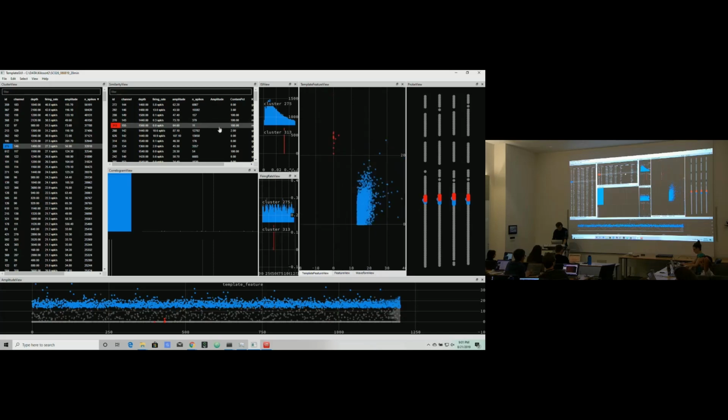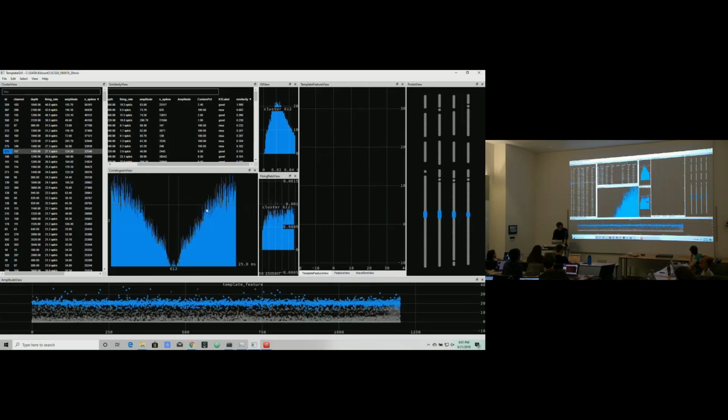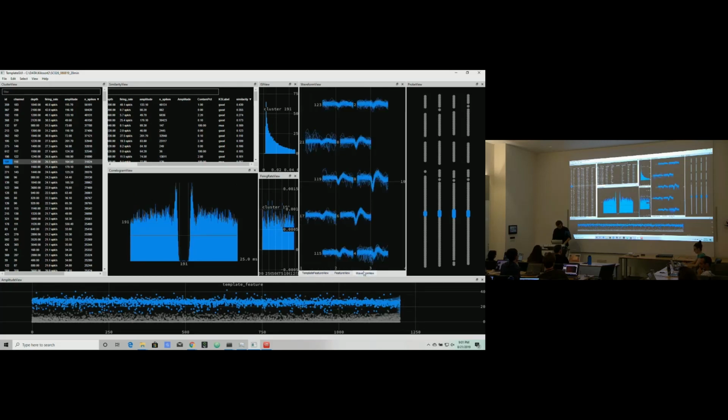Mostly if we're already far away from the top of this list, so the similarity is low, we're not going to really find anything else anymore. Okay, this is very, very good with phi. It's a big improvement in terms of speed too, because it used to be with these really large data sets there's a lot of data being moved around and loaded and plotted, and this new version is really fast with that. So that's pretty cool.